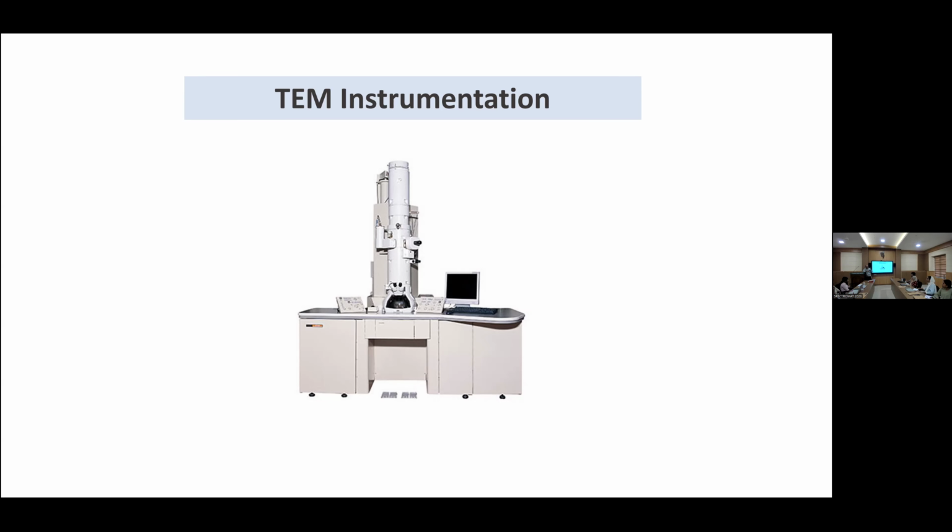With the TEM, it is possible. Like if you are using STEM, high resolution STEMs, like atomic level electron microscopes, you can directly see the holes, line defect, point defect, everything is directly visible there in the lattice pattern. But for that, we should have aberration corrected STEM or atomic resolution microscopes.